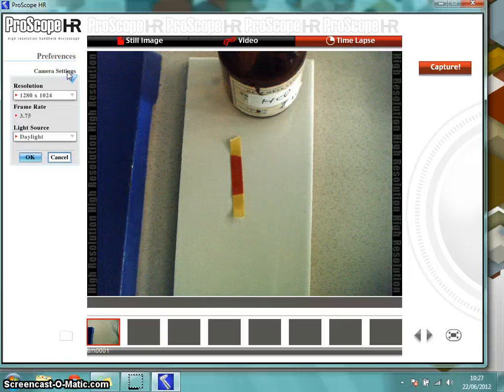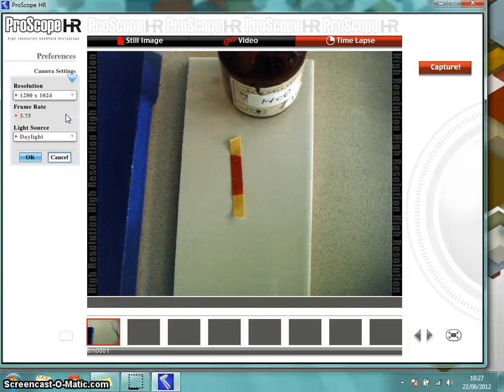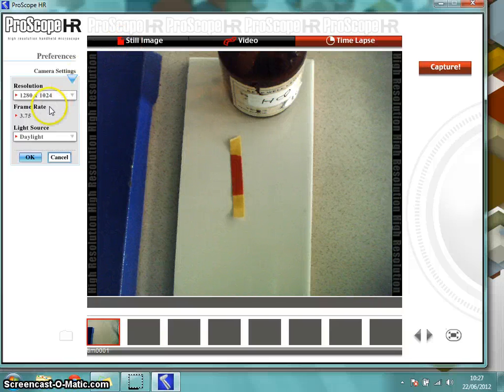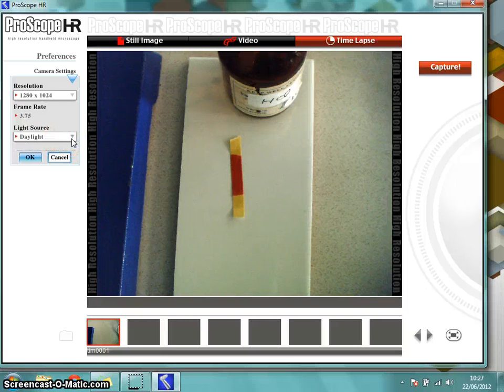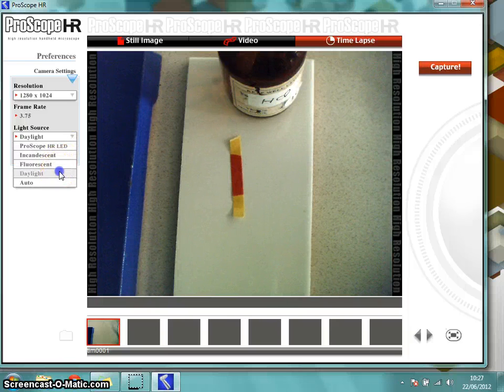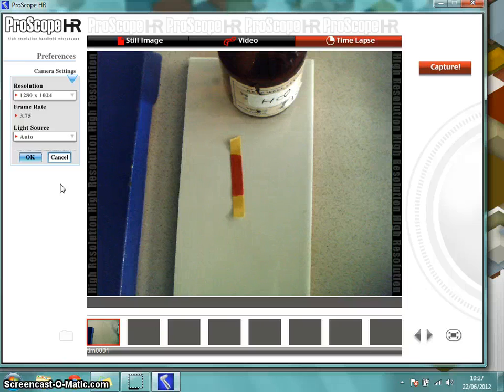Over in Preferences we have the camera settings. The trick here is to go for the highest resolution — that improves the quality drastically, and our computers are more than capable of handling it. Frame rate would only apply to time-lapse photography. I haven't got the fluorescent lights on so I've set the light source to Daylight, but if you don't want to think about that you can put it on Auto and let the software figure out what to do.